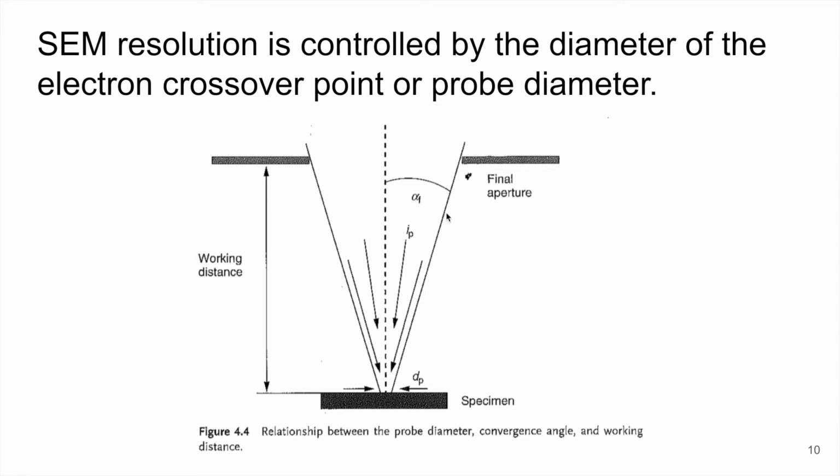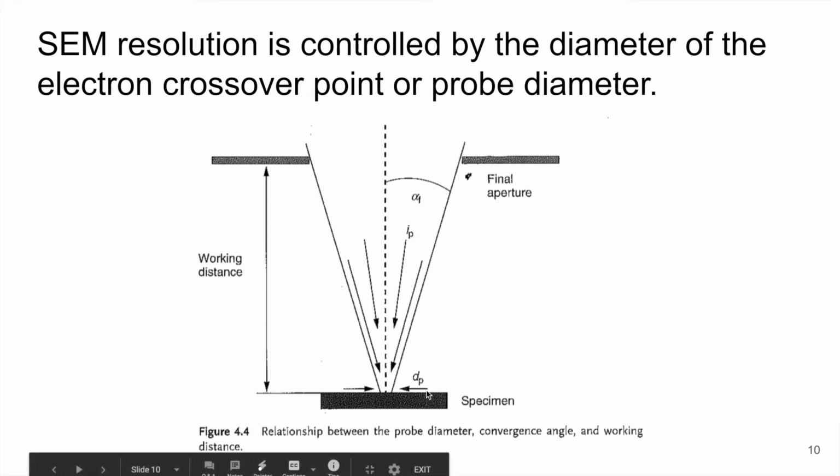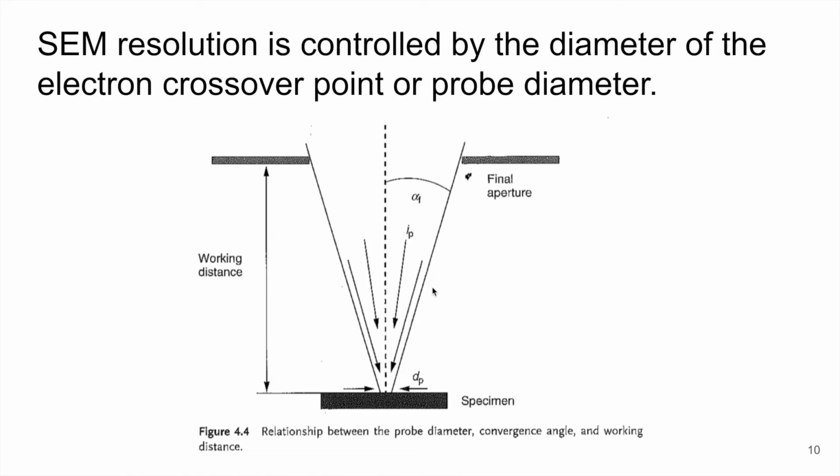One other thing that you see here on this drawing is the actual electrons in this beam that are crossing over. Since there is a flow of electrons from the gun down to the specimen, we can represent that flow as current. And so that tells us about the intensity and so forth. And so the current of the electrons is known as little i subscript p, for probe.